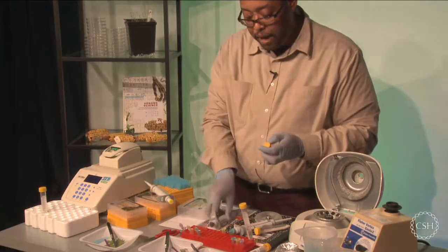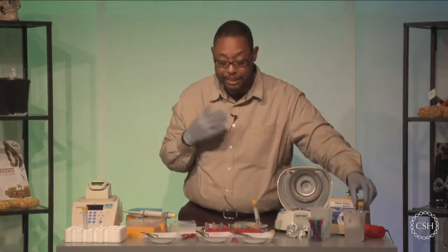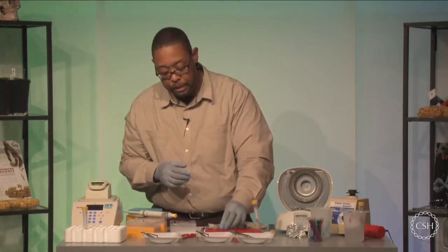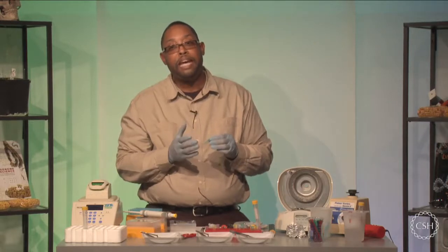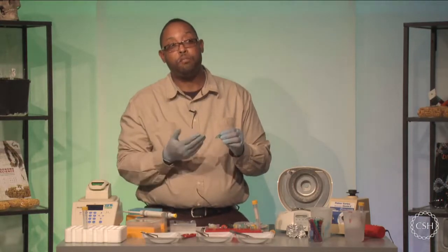Okay. I've added wash buffer to each individual test tube. I'm just going to place that back on ice because I still want it to be very cold. And I'm going to close these test tubes up. Now, the objective here is just to wash the pellet. If you can get the pellet fully resuspended, that's great. If not, that's okay. We just want to have the pellet lift up and sort of mix around.